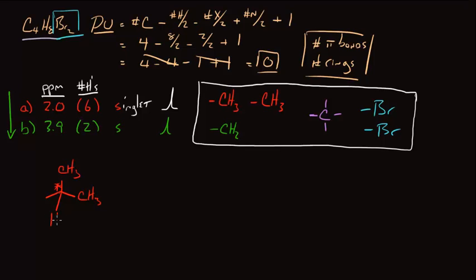It's not going to be a carbon that has a proton on it, because if this was the case, the protons on the methyl groups would show up as a doublet, because there's this extra proton here. But since they're a singlet, that means that this carbon has no protons on it, so it's going to be quaternary. And if we look up in our box of pieces to our puzzle, you'll see that we do have a quaternary carbon that we drew out from before.